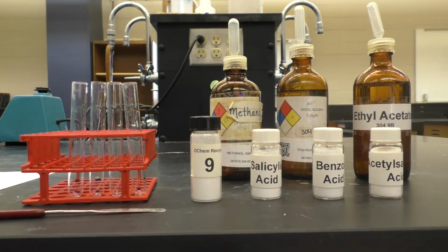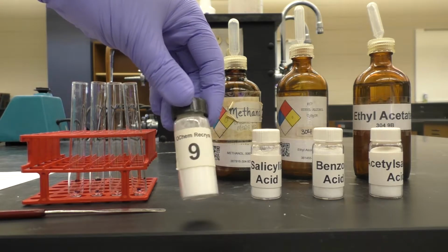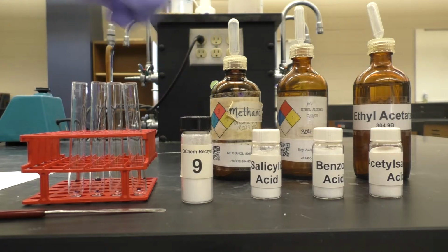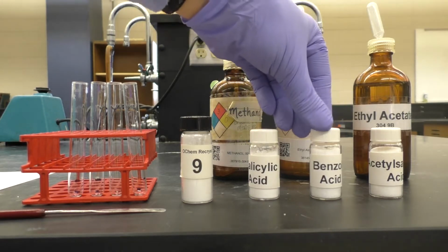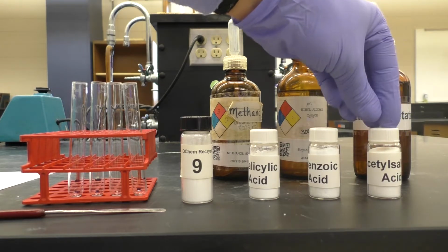Here we are in lab. We've been given unknown number 9 here. It's a white solid, and we've been given it to recrystallize. Now, we know that unknown 9 is either salicylic acid, benzoic acid, or acetylsalicylic acid, which is actually aspirin.